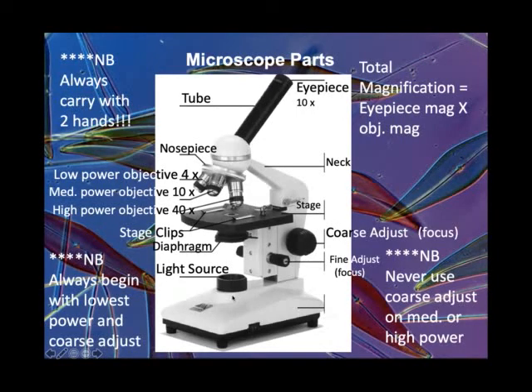All the microscopes that we have in class are electrical microscopes. You have to plug them in.